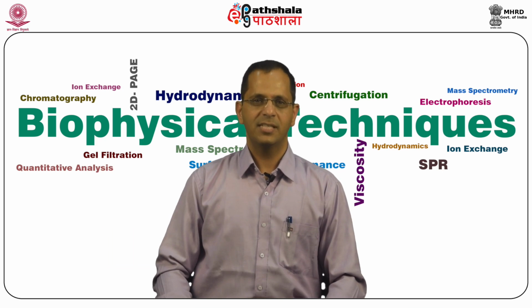Today, I am going to discuss with you the aspect of sample preparation for proteomic experiments, under this particular paper, Techniques in Molecular Biophysics.